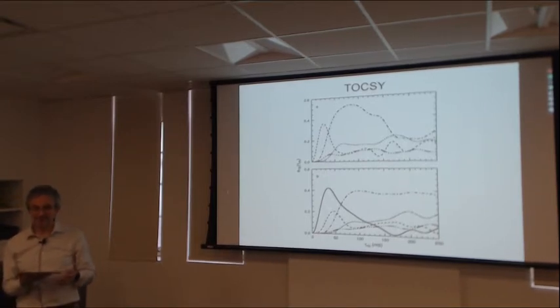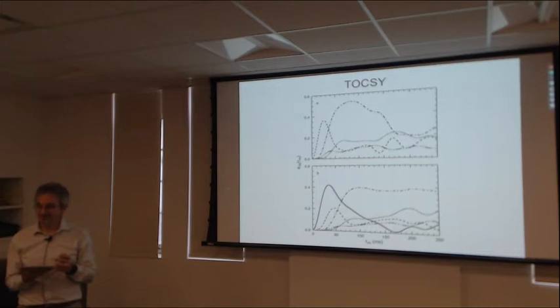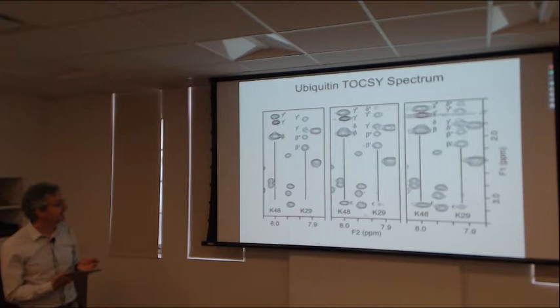But that's pretty tough work because this is all convoluted with relaxation losses and different sizes of the coupling constants that we don't really know. The carbon experiments have made that much easier. So here's just some data from ubiquitin as a function of mixing time.